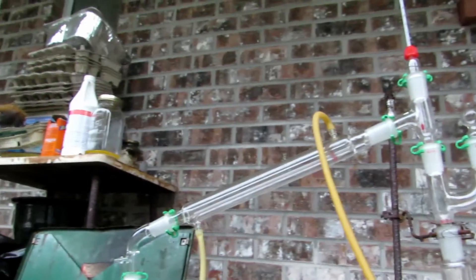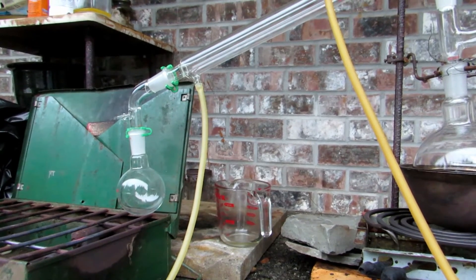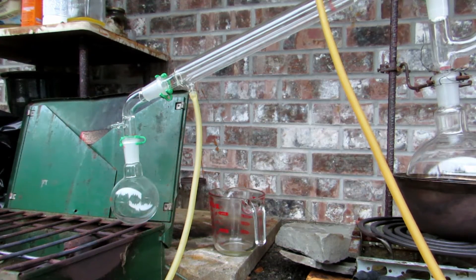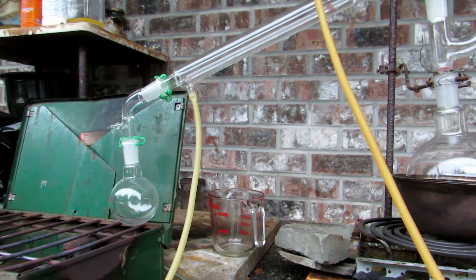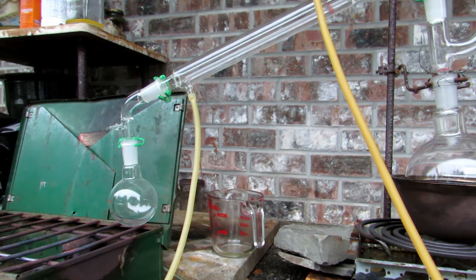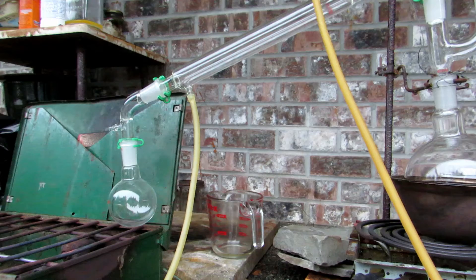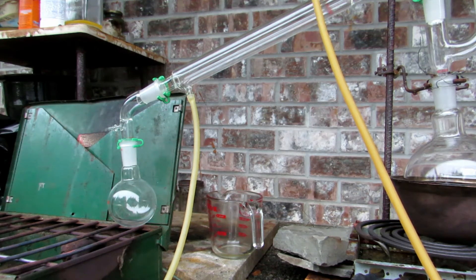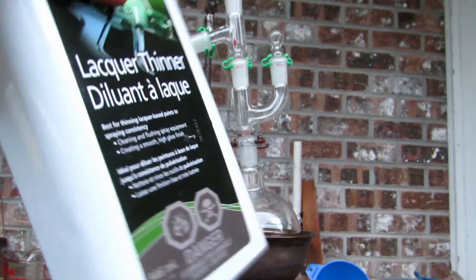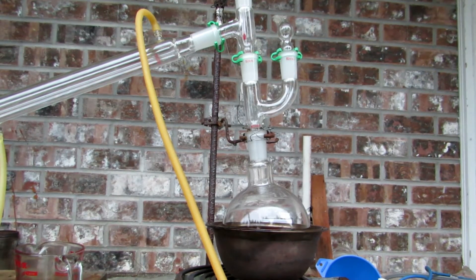Above that we have the thermometer condenser column, and I just have a small 250 milliliter round bottom flask to begin — that's going to collect our methanol, which comes over first at about 65 degrees Celsius. After that, our methylethylketone will come over at 80 degrees Celsius, and finally we'll get our toluene. I'll switch that out for a 500 milliliter round bottom flask to collect the toluene, which comes over at 110 degrees Celsius. Now we'll open up the claisen adapter, put a funnel in, and add in about half of our bottle of lacquer thinner.